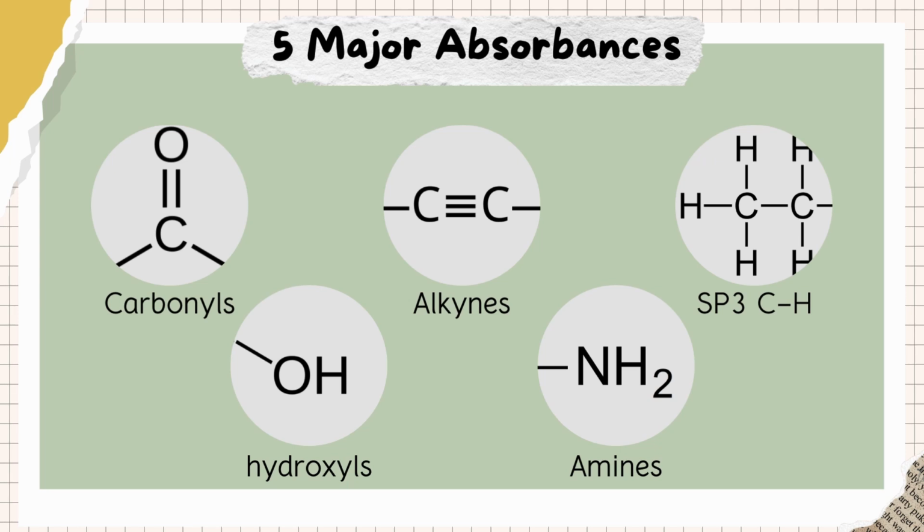Although there are many molecules that have this, hydrocarbons in general, right? It sometimes comes down to just that fine difference. This peak is pretty common across different IR spectra, so may as well know it. For the class that I teach, these 5 must-know categories usually narrow down your answer pretty well. Keep in mind that different IR absorbances usually have a range to look through, but I'm going to give it as one solid value to look around so that it's easier for you to study and remember.